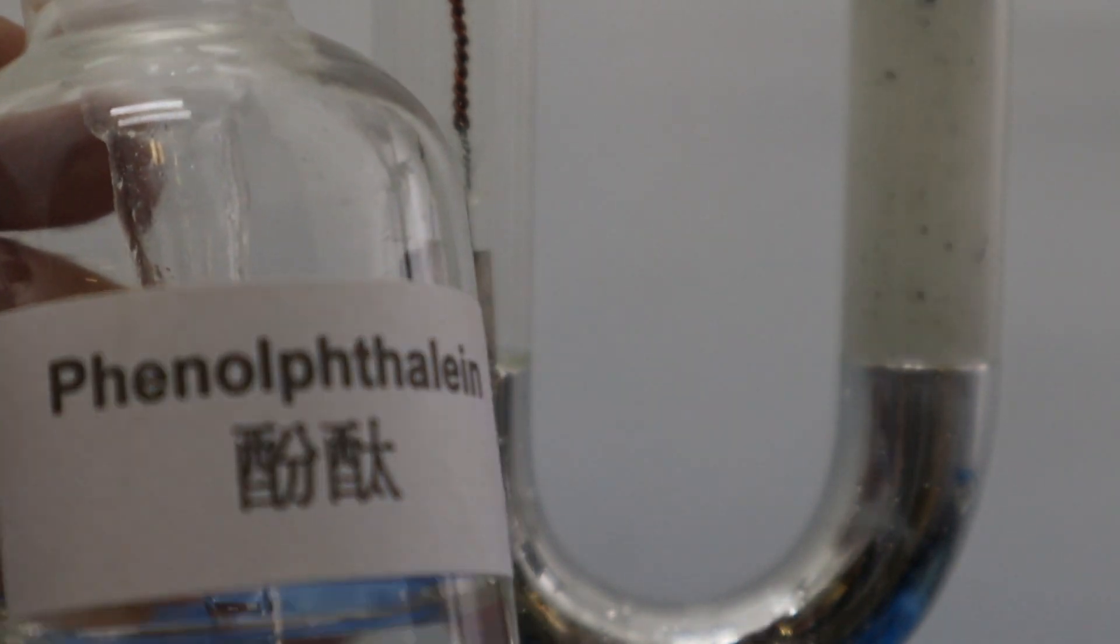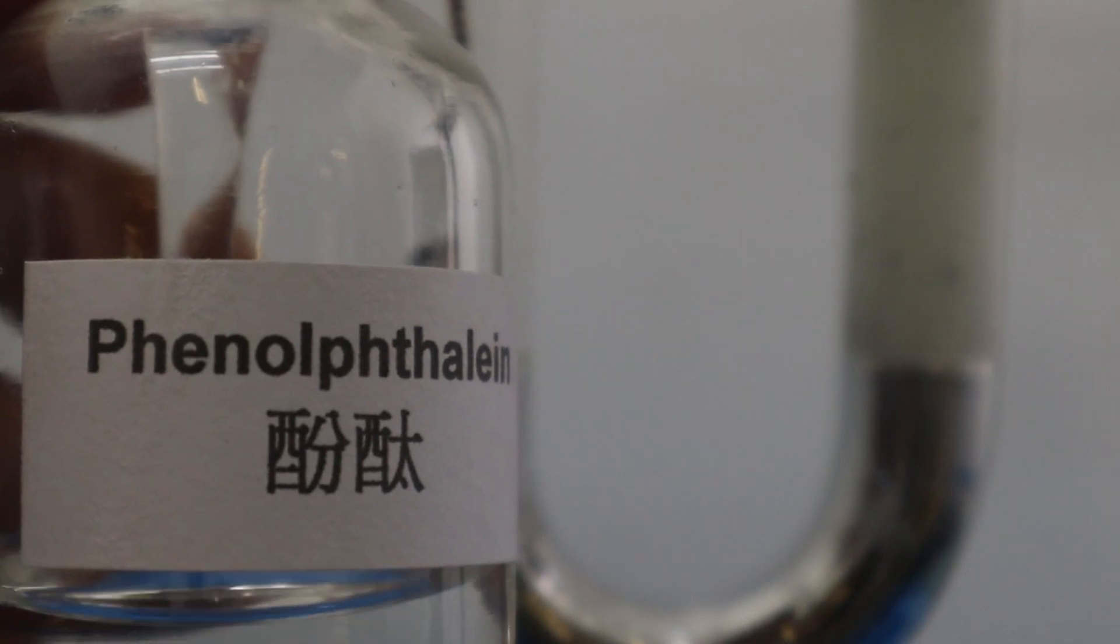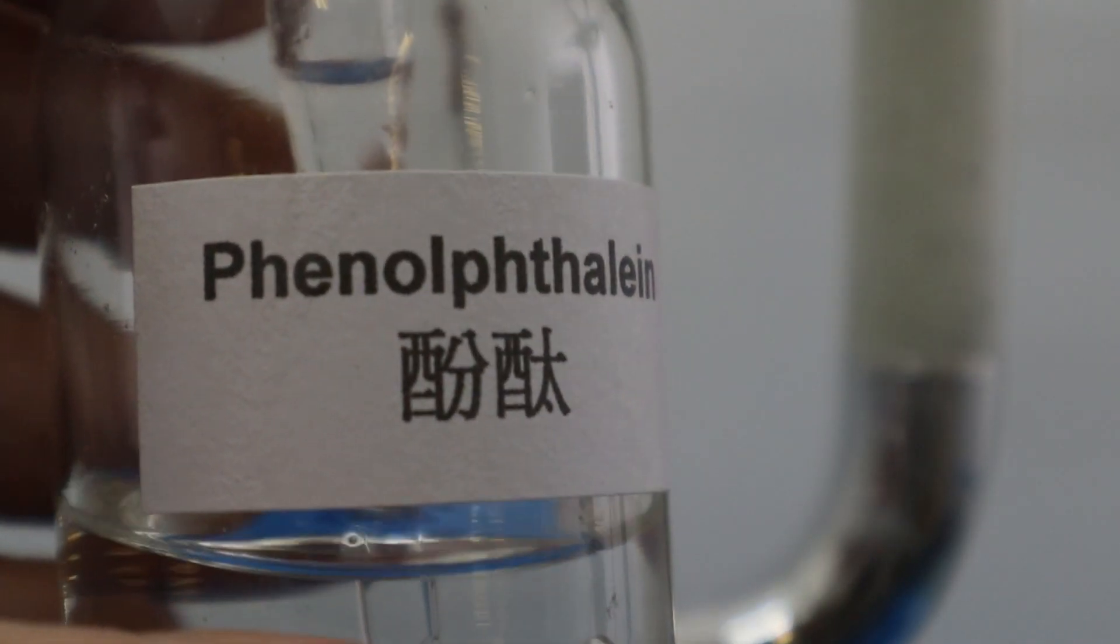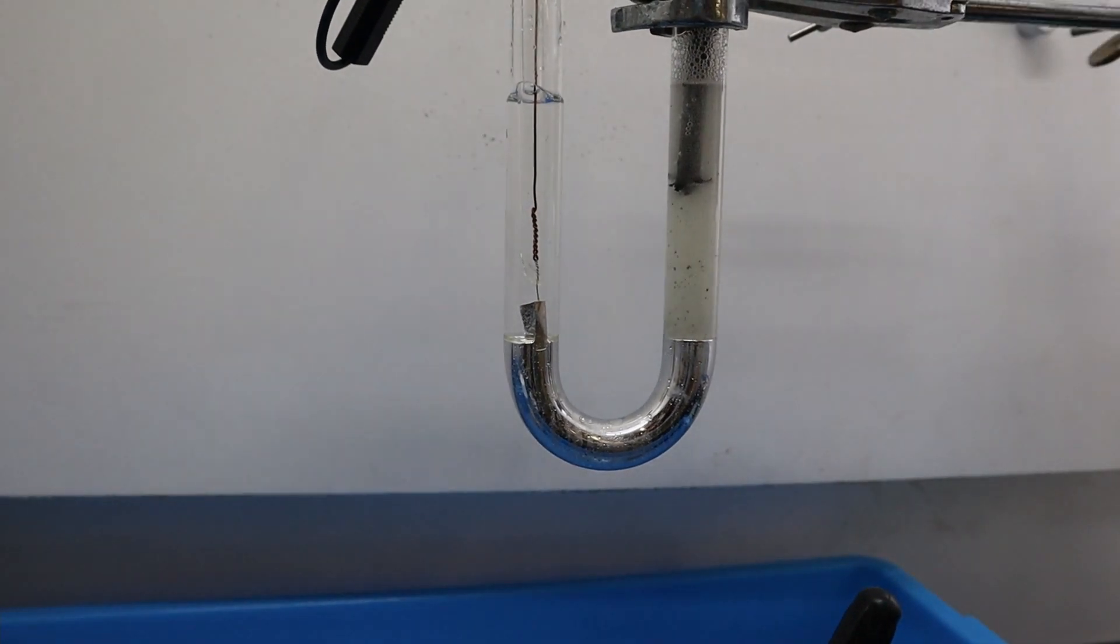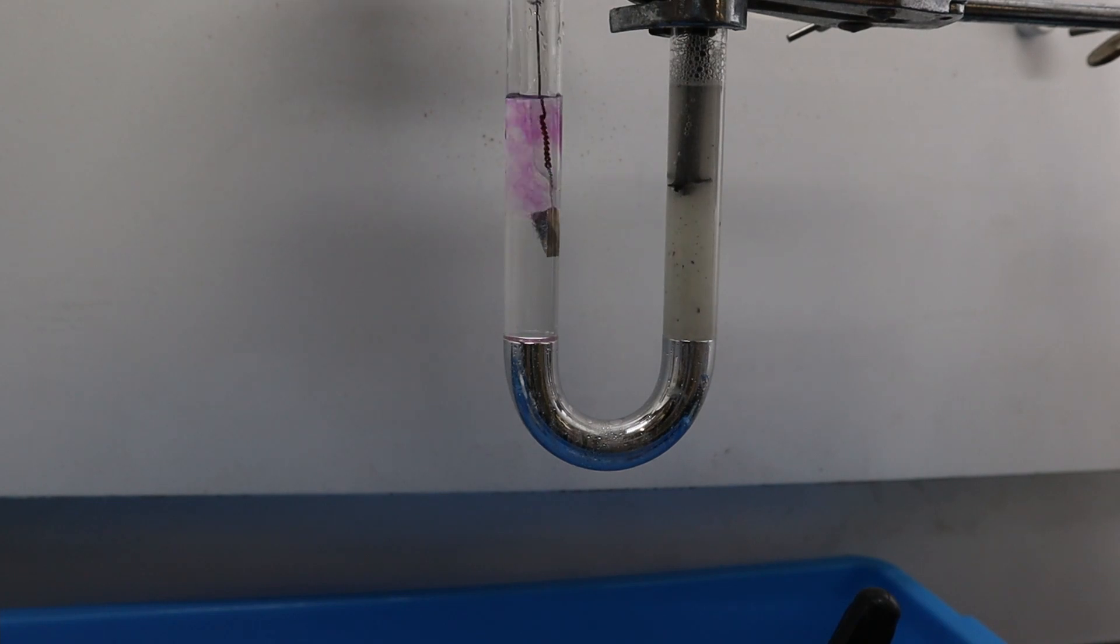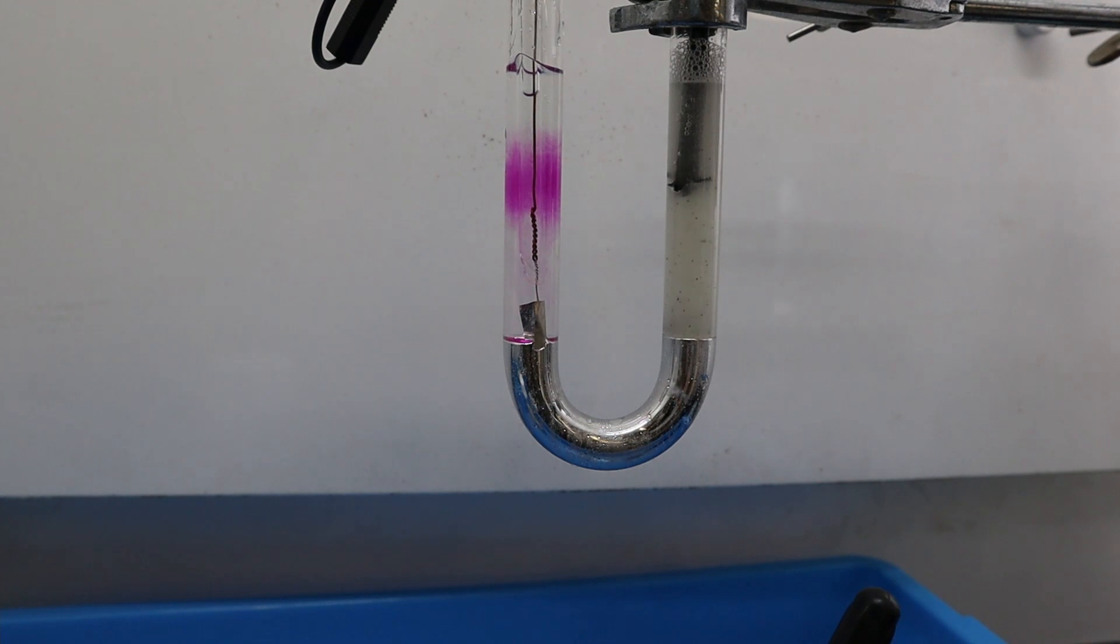Finally, I add phenolphthalein to the deionized water to test for sodium hydroxide. A pink color is seen. This proves that an alkali solution is formed. That is sodium hydroxide solution.